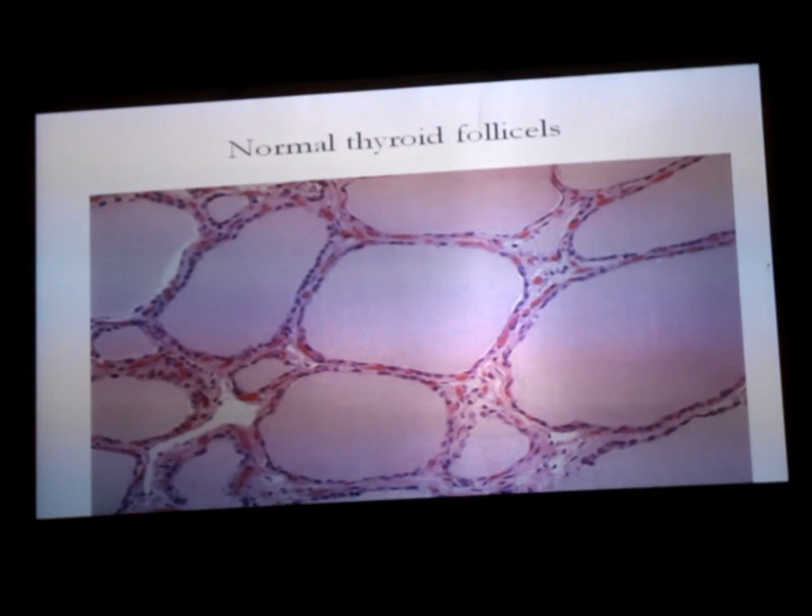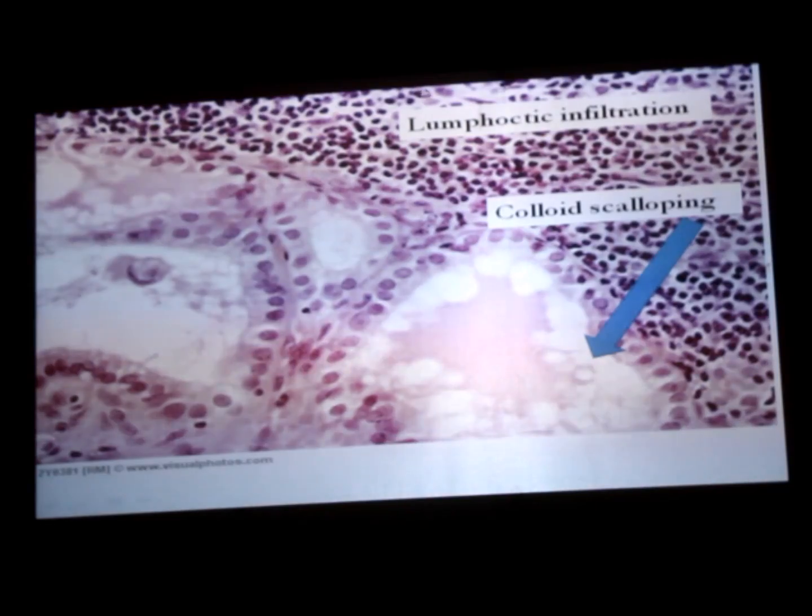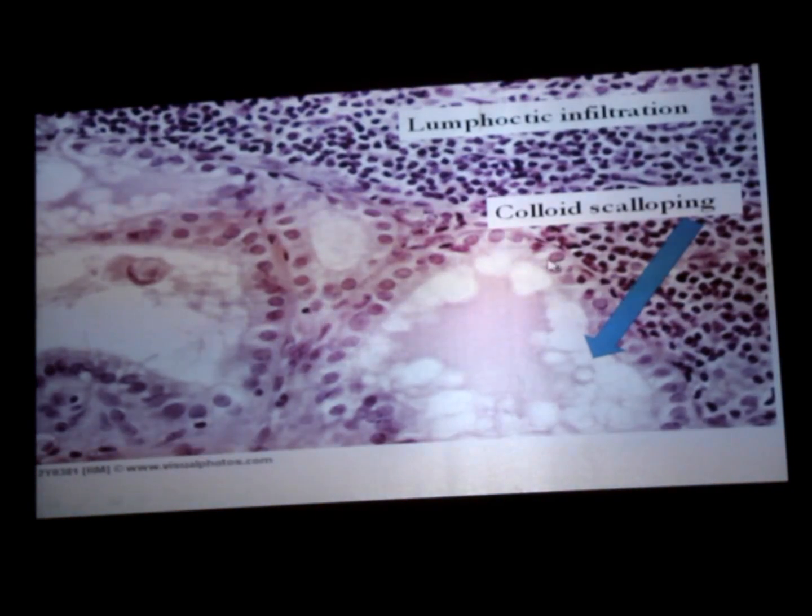Thyroid gland, there are two slides. One is of Graves' disease of thyroid, second is papillary carcinoma of thyroid. This is normal thyroid gland. These are normal follicles containing colloid. These are the follicular epithelial cells. These are lymphocytes. This is about Graves' disease.